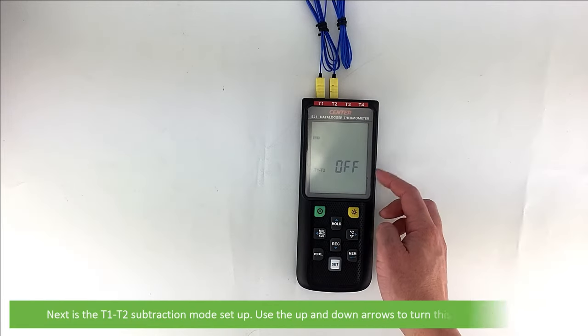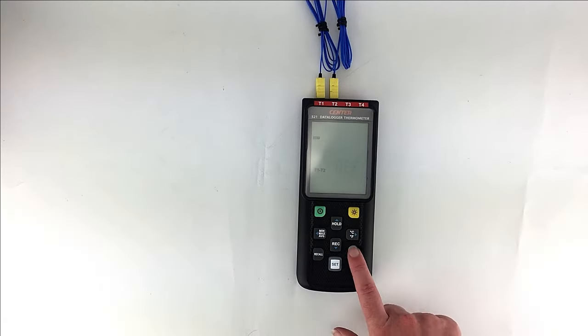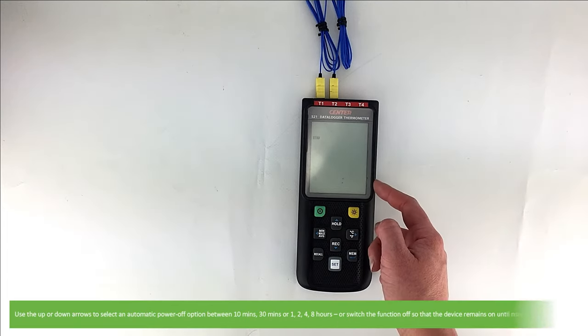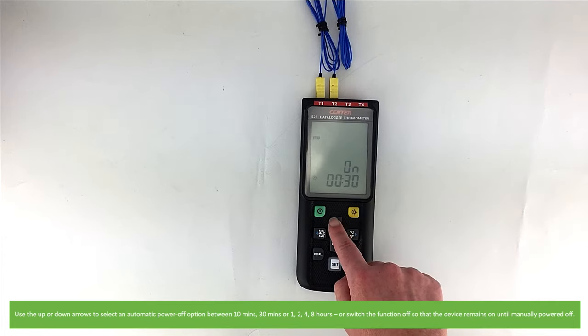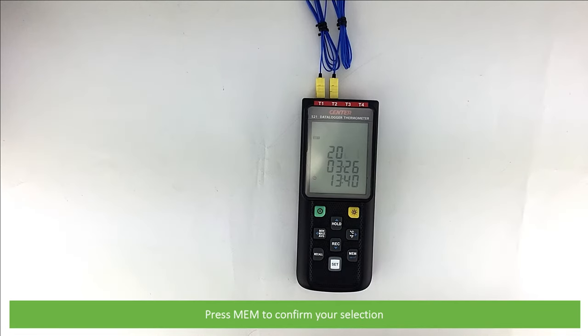Next is T1-T2 subtraction mode setup. Use the up and down arrows to turn this function on or off. The second last setup selection is setting the auto power off time. Use the up or down arrows to select the automatic power off option between 10 minutes, 30 minutes, or 1, 2, 4, or 8 hours, or switch the function off so that the device remains on until manually powered off. Press memory again to confirm your selection.